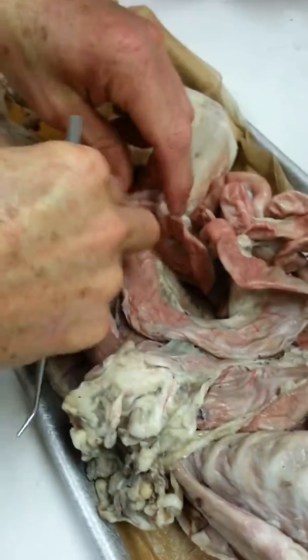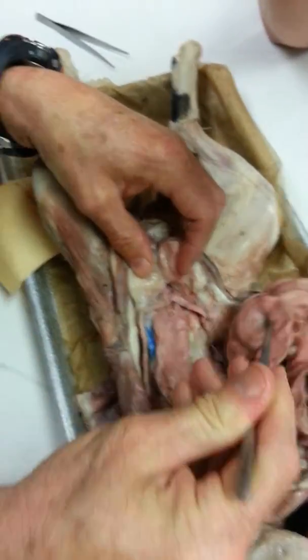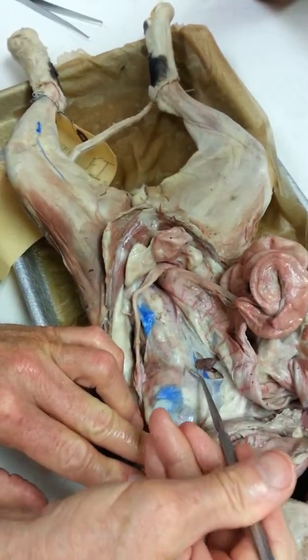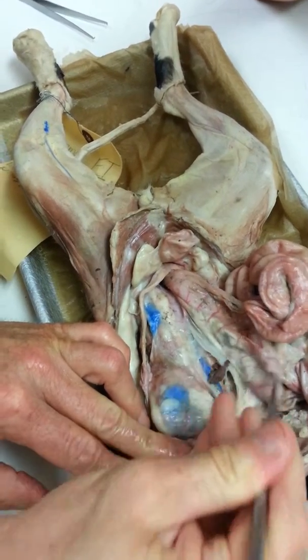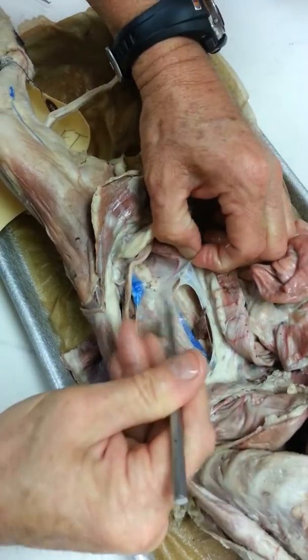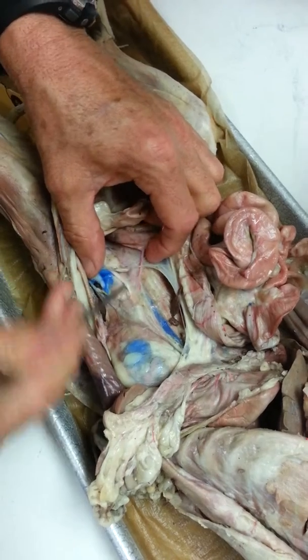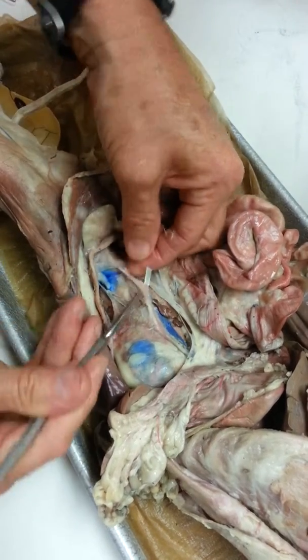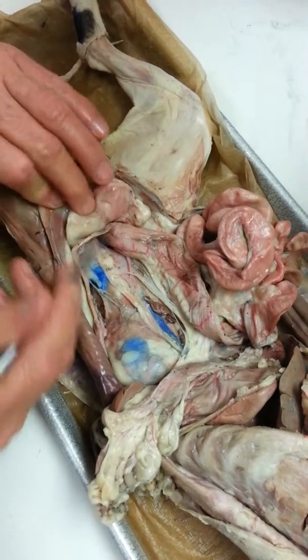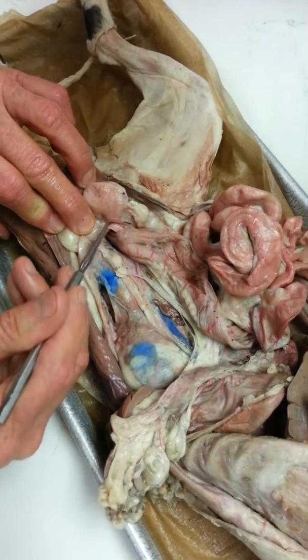This is urinary bladder right here. This is the urinary bladder, and we'll do the urinary system first, and we'll look over here. This is the kidney right here. So if we dissect this kidney a little bit, show you something on this. This right here is a ureter, and that carries urine from the kidneys down here to the urinary bladder right here. So you can trace this all. It's right here. The one from each side is going to run right into that urinary bladder.